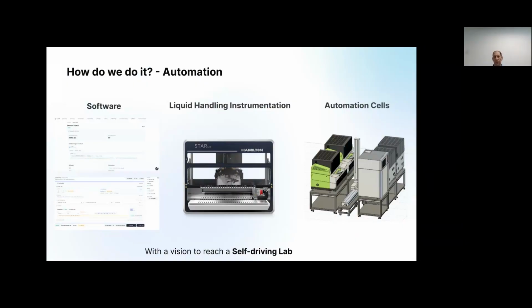And then the protein readout, their characteristics, is being measured usually, if we can, in automated cells. And automated cells means we have several measurement instruments and a robotic arm and a fridge. So this can run 24/7. We don't need people to feed the instruments only during working hours.